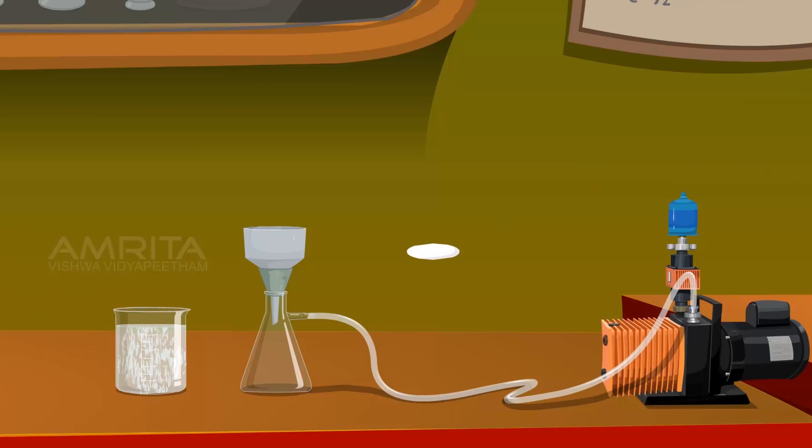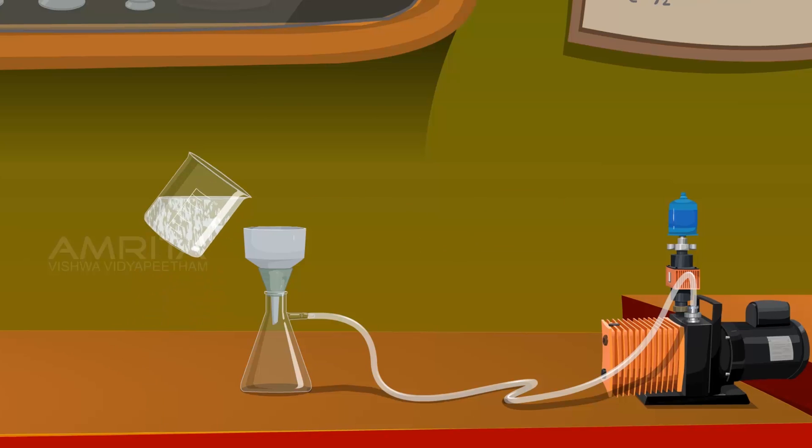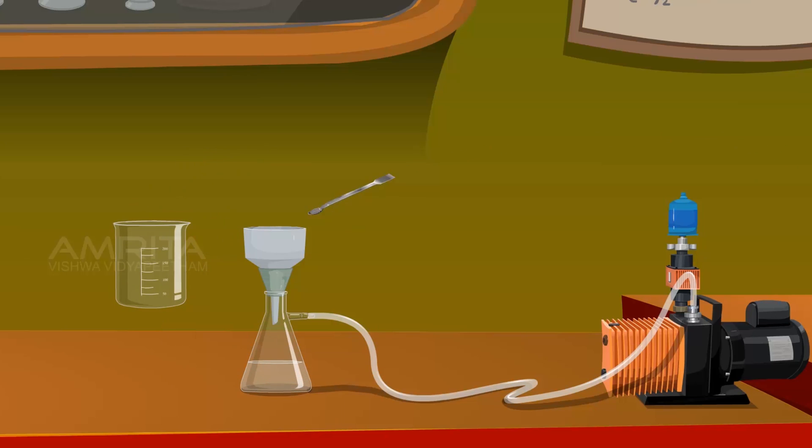Take a filter paper and place it on a Buckner funnel. Filter the precipitate through the Buckner funnel. Transfer the precipitate from the filter paper into a beaker using a spatula. Wash the precipitate with distilled water and again filter the precipitate.